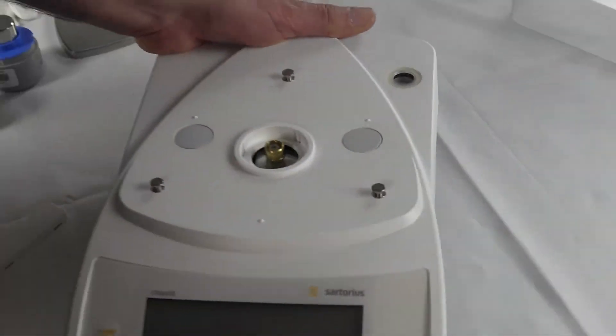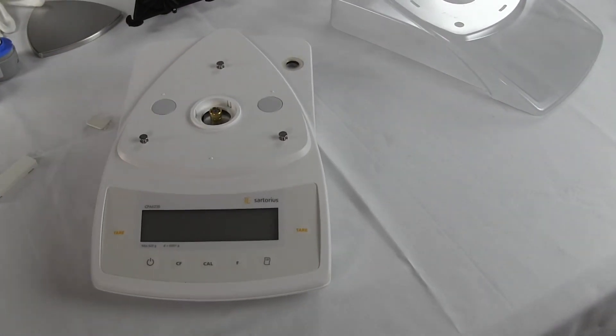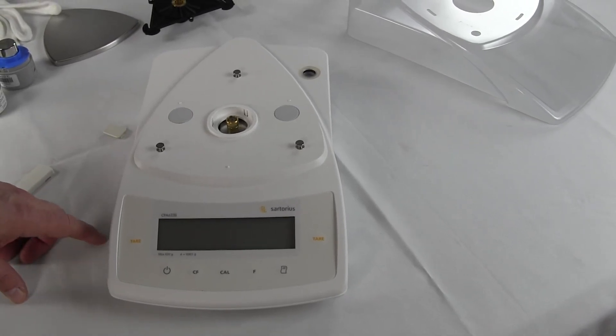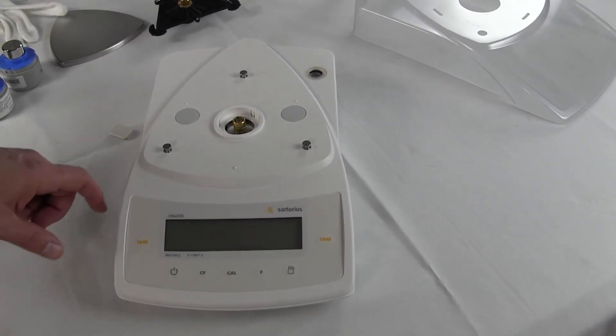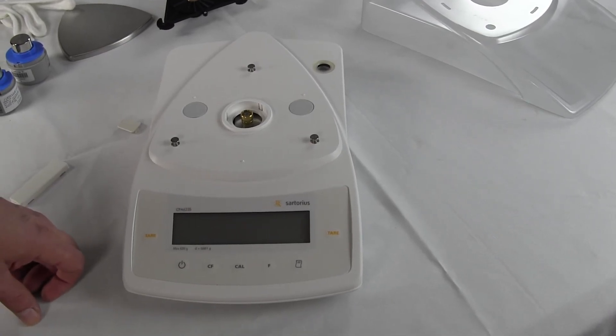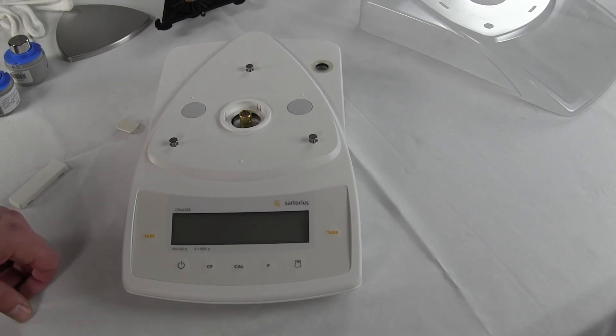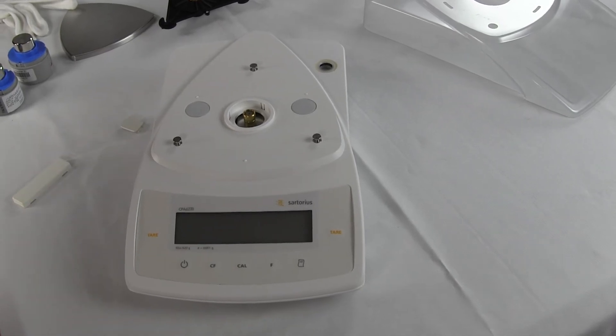This is the Sartorius CPA 623S. This is 620 grams by 1 milligram. This is Precision Weighing Balances. You can visit us at either balances.com or scaleman.com. We're an authorized Sartorius dealer. If you have any questions, give us a call.